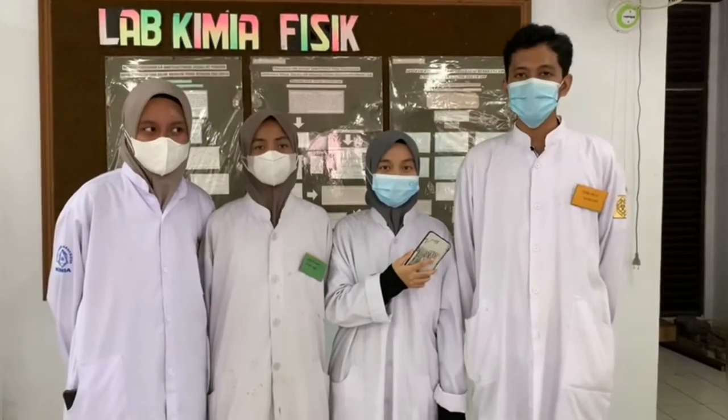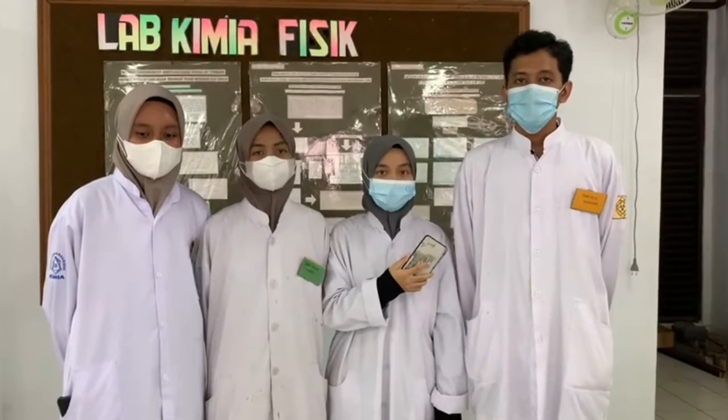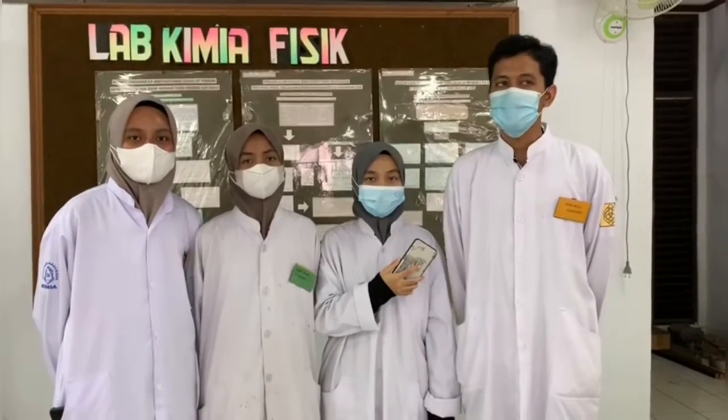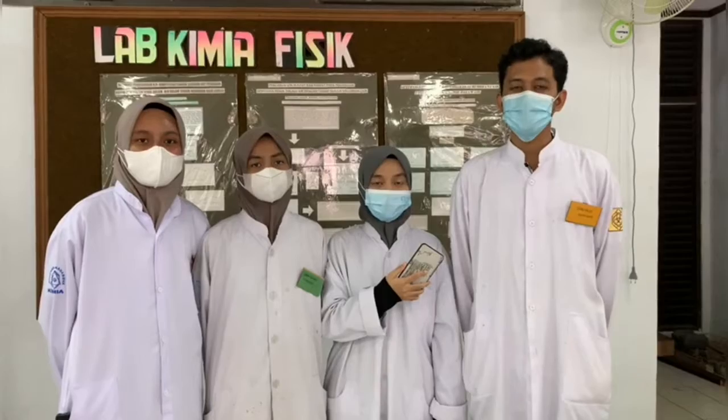We are going to do the practice of Physical Chemistry 1 with the title of our object: Determination of Calorimetry and its application.